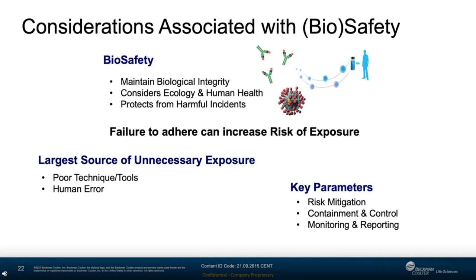I was also in a lab where a balancing error led to a spindle on the centrifuge that stretched out basically into a very, very long piece of wire. We were not exactly sure how that happened. I'm sure Bob could explain it. And I've personally witnessed a number of runs that had to be aborted. All of these were due to either balancing problems, failing to seat the rotor correctly, or failing to check that the swinging buckets could swing freely. In other words, they were all due to operator error.